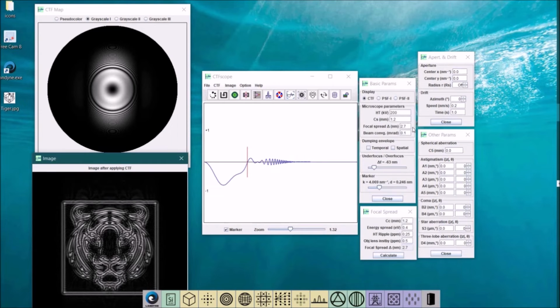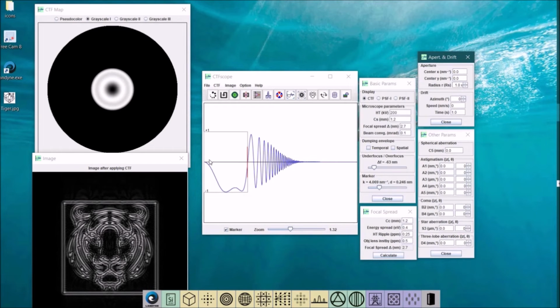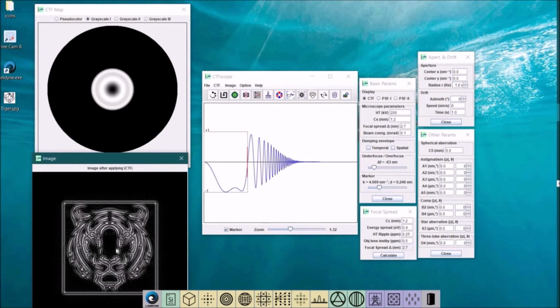We can also simulate the aperture effect on the image. So we can apply that with the Scherzer focus, and you can do the processing now. Yeah, that is the image with the aperture only cut off at the Scherzer focus. And you can see, because here flip over and down is the same, when we choose point spread function 2, that image has no changes.